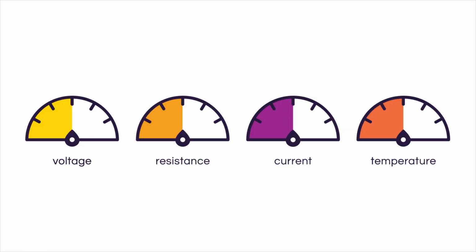So if you're going to transfer a large protein, you may want to add a little bit of SDS to your transfer buffer, probably something between 0.1 and 0.25%, so that it's a little bit easier for the proteins to elute from the gel. However, if you add too much SDS, they may never bind to the membrane, so remember to take baby steps on that. In addition to that, when we add SDS to our transfer buffer, we're going to have an increase in current and therefore an increase in temperature. So when we add SDS to our transfer buffer, we need to make sure we do everything we can to keep that system cold, make sure it doesn't overheat.